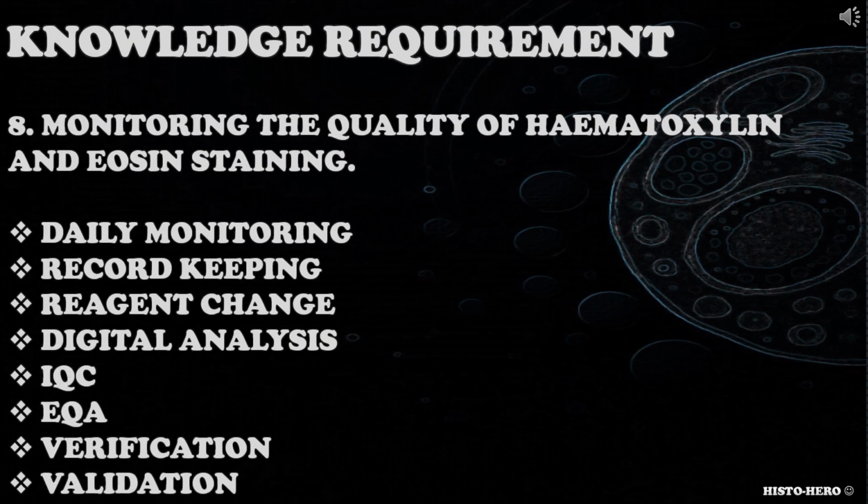The eighth knowledge requirement is for you to monitor the quality of haematoxylin and eosin staining. How do you monitor quality of H&E staining in your laboratory? What are the common quality issues associated with H&E staining? How would you resolve them? Consider daily monitoring, record keeping, change of reagents, digital image analysis, IQC and EQA slides, verification and validation of reagents.